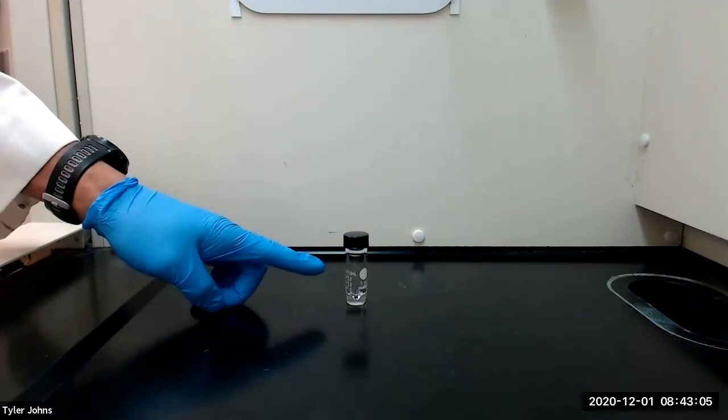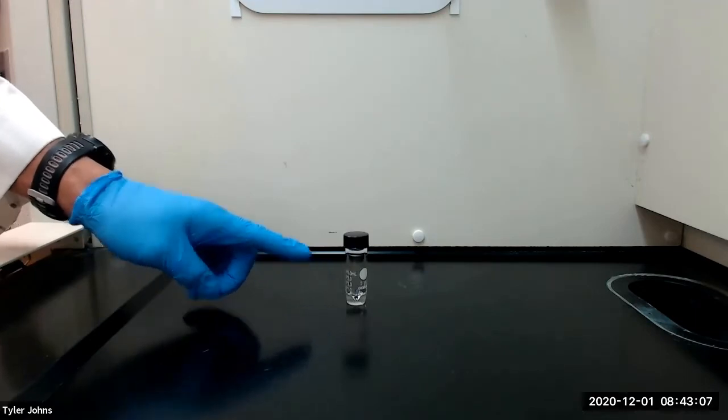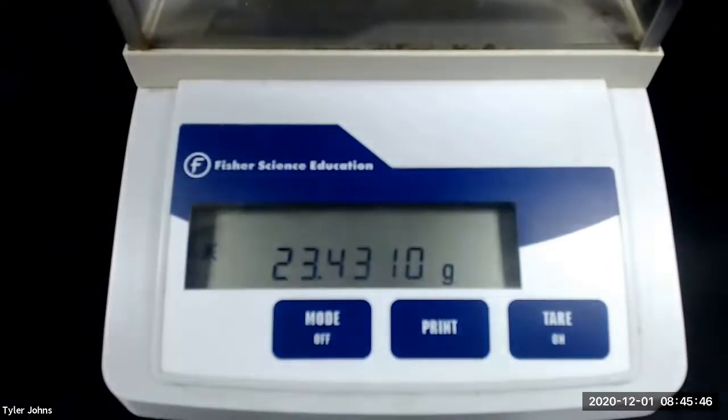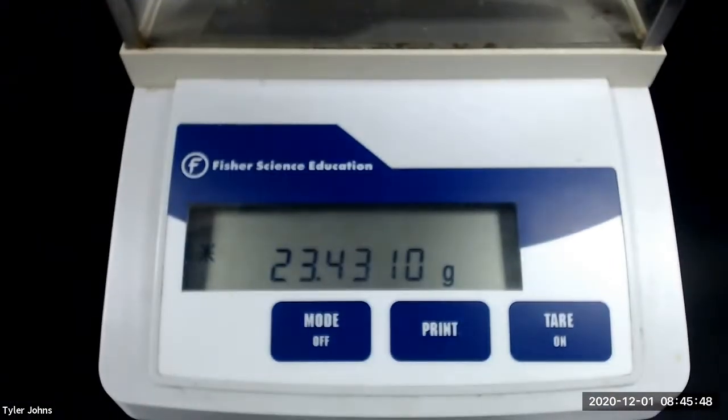We will begin by pre-weighing a 5-milliliter conical vial. The mass of the pre-weighed 5-milliliter conical vial is 23.4310 grams.